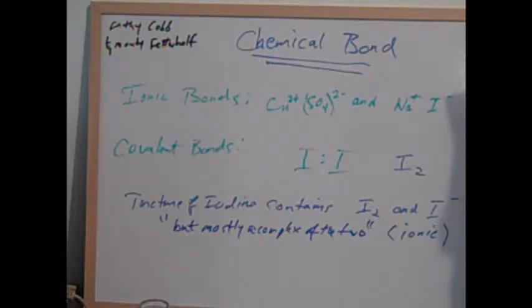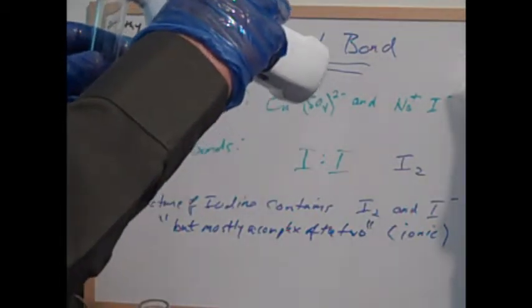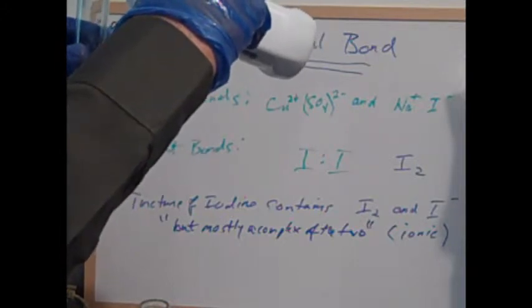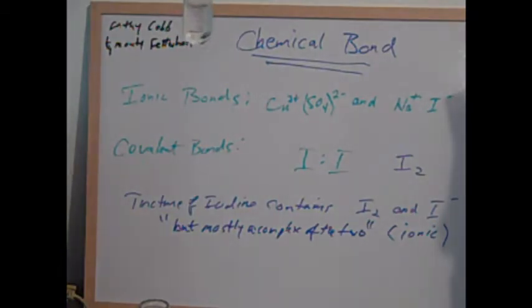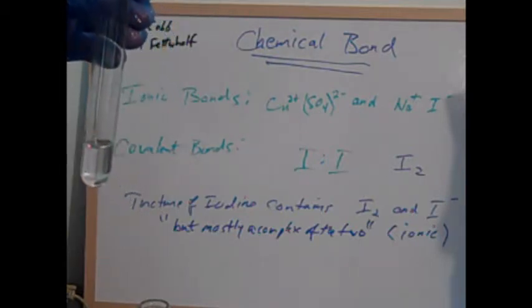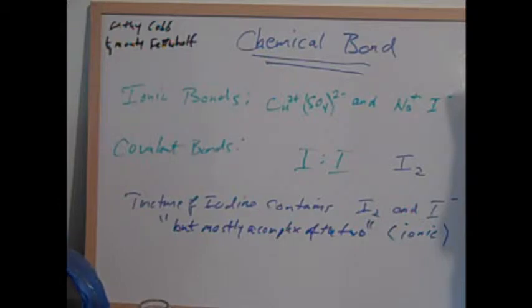And nonpolar covalent substances like this mineral oil, which we bought, and we're going to use a test tube instead of a 2-liter soda bottle. I think it's neater. You pour about an inch in it, a little bit smaller scale than they have in the demonstration. But nonpolar solvents or covalent solvents like mineral oil are going to dissolve substances that are covalent like iodine.